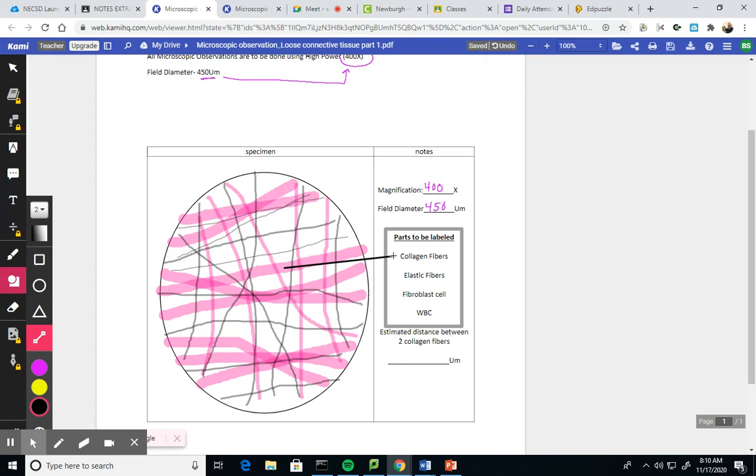If I want to show 2, I go back to the original word, do it a second time, like that. Easy. Elastic fibers are these ones, right? So I could go from the structure to the word, from the word to the structure. Perfect. And it's clearly labeled.